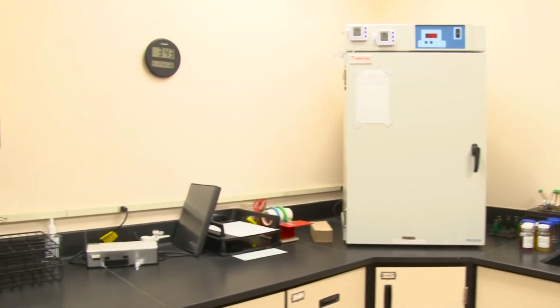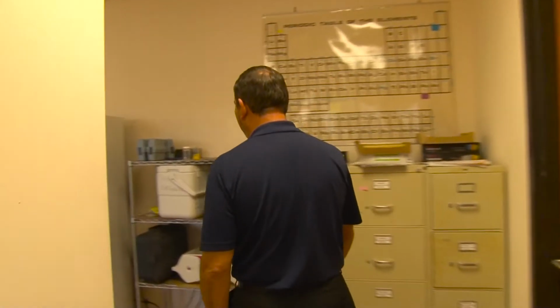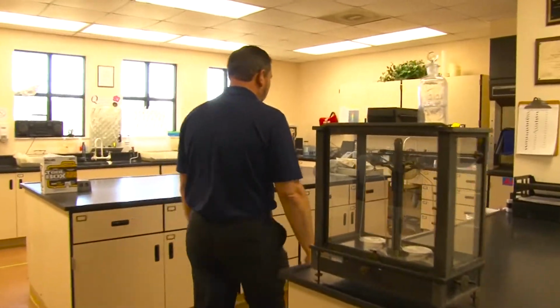We're going to walk into the operator's lab. The operators check samples every 2 hours. The lab is only Monday through Friday, so after hours, the operator's always here.